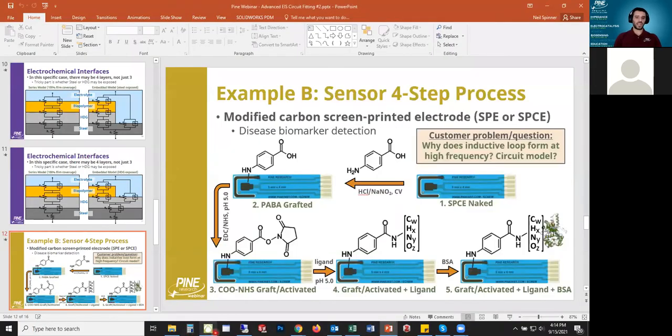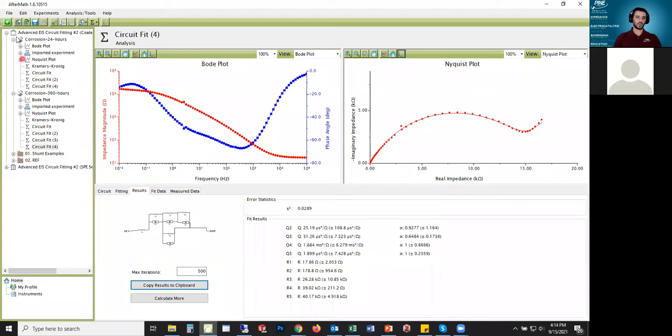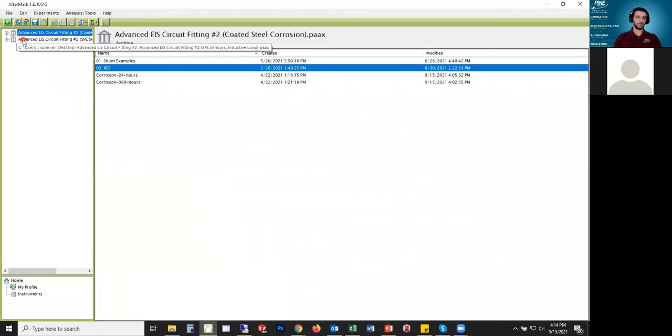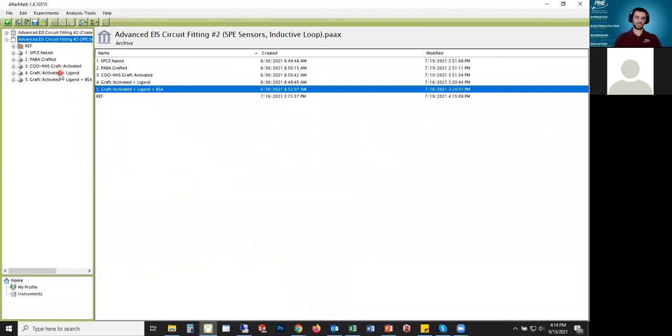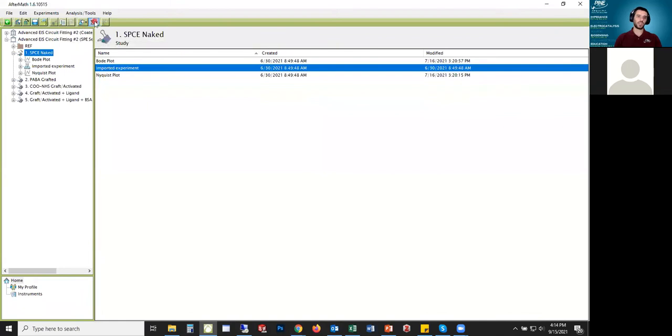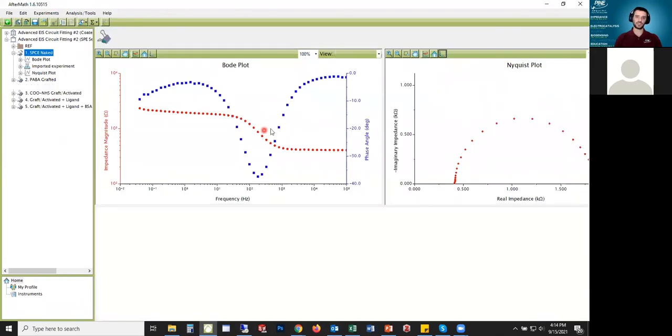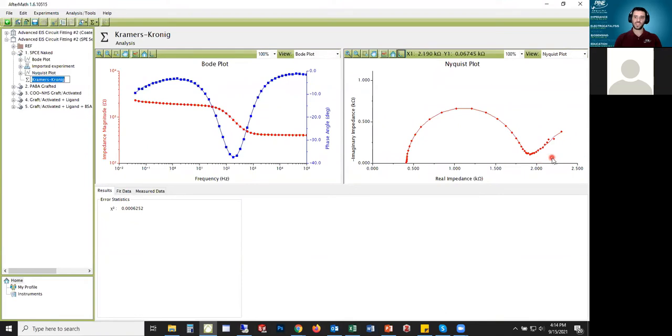I'm going to get into the data here and what I'll do is I'll first show the first three steps because I'll just give away the answer that this high frequency inductive loop showed up in the last two, on four and five. So I will somewhat quickly go through the circuit fits for stages one through three and I'm not going to give too much analysis because I want to try to focus on that high frequency inductive loop that was the interesting feature for this data.